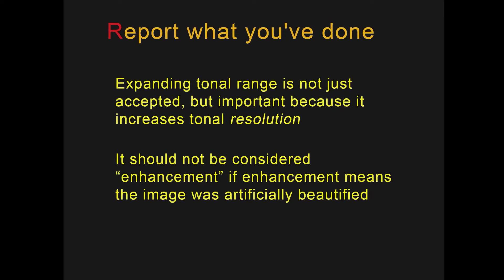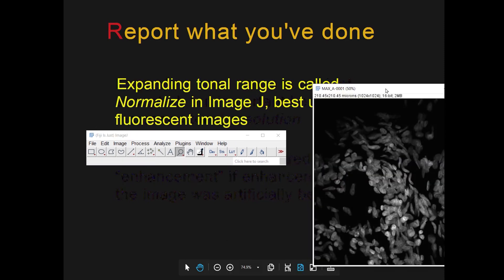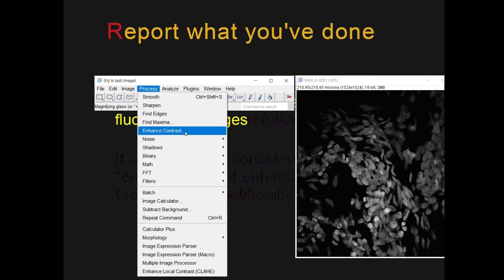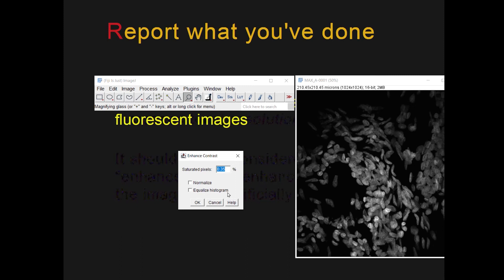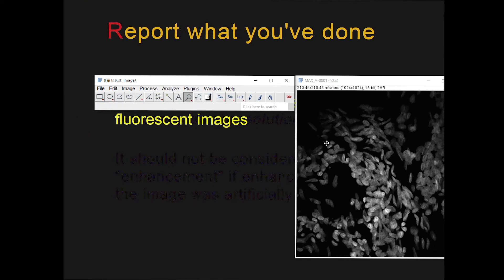Expanding tonal range should not be considered enhancement if enhancement means the image was artificially beautified. Expanding tonal range is called Normalize in ImageJ, and it's best used for fluorescent images. In ImageJ, open your image and go under Process to a mislabeled function called Enhance Contrast — you're given two choices. One does enhance the contrast: that's the Equalize choice, but we're going to choose Normalize. Because we don't want many pixels to be oversaturated, we'll put in 0.01 and click OK. That will allow the image to become brighter if it's too dim.